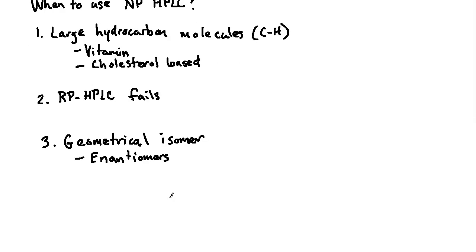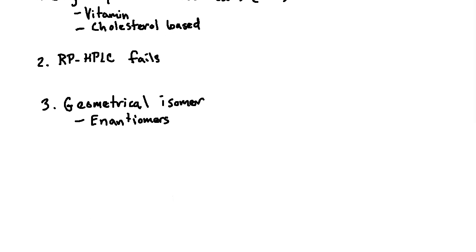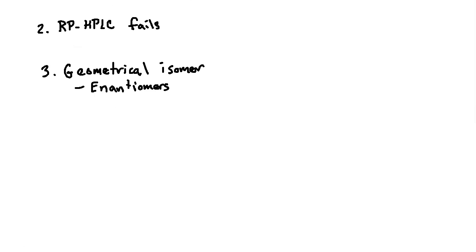Okay, so to give you an example, let's take a look at a column bed where there's two different enantiomers and one may be separated out compared to another. Maybe not enantiomers, excuse me, but geometrical isomers. So give me a second and I will set that up. Okay, so to illustrate this example, let's consider a bare silica column this time. All right, so we've got these silica-based functionalities that have the hydroxyl coming off it, right? That's the bare silica. And you can see this along with the diol columns. These are going to interact strongly with water, which again, I'm kind of previewing. Water needs to be handled with care in these types of environments.